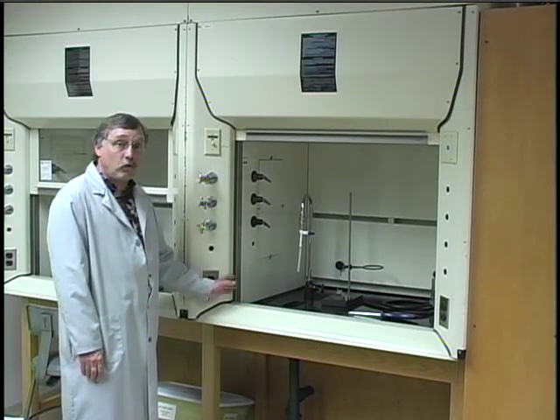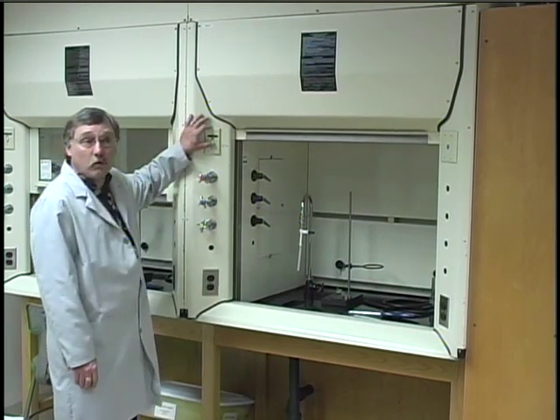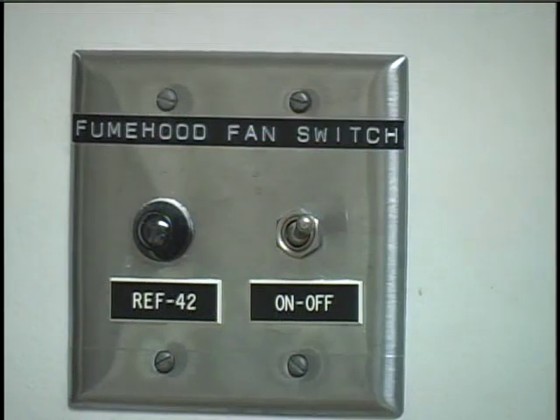Each lab has four fume hoods that you would use if you were working with chemicals that gave off toxic fumes or irritating vapors. Each fume hood has individual controls for light, compressed air, and gas, and each has a sink with water in it. The exhaust fan, however, is turned on by a switch on the wall that controls all four hoods. Note the location of that switch in your lab.